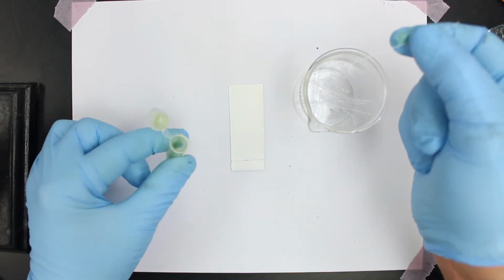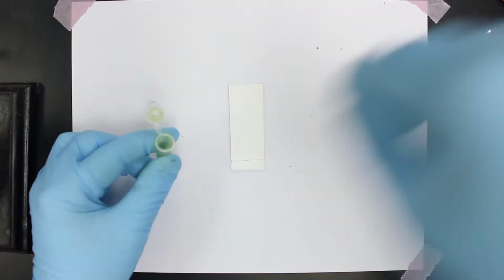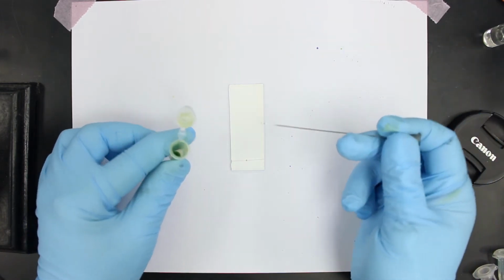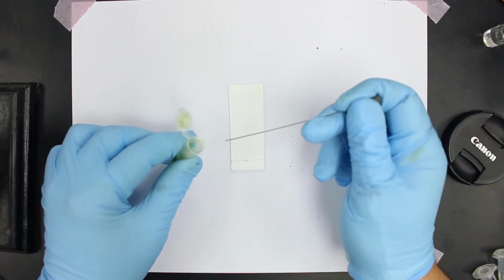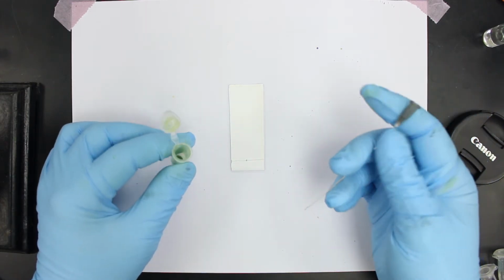Now these are a little fragile and I always tend to break them. So instead, I'm going to use a very thin needle, which I have cut the tip off of. This is referred to as a spotter. Some spotters are metal like this one, but you can also use glass spotters.